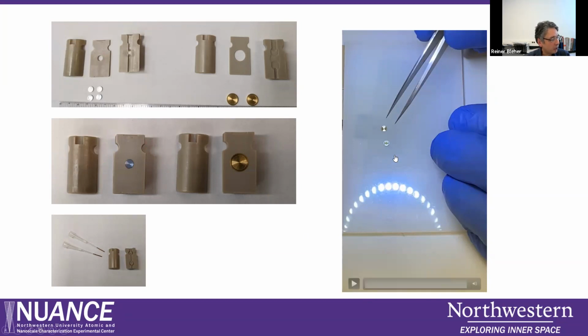And here we see a short sequence. We can see a carrier that contains a sample, and I will put the lid on top of this carrier. That one has a flat bottom, and then the sandwich, the cartridge system, is built, and the sample is frozen. It's a very short sequence.